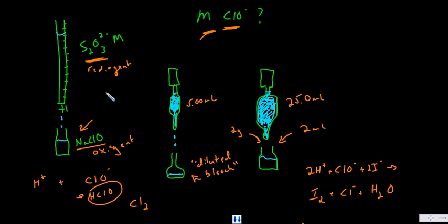And so we're going to be preparing a solution of sodium hypochlorite first. So we're going to take commercial bleach solution, which is bought in a grocery store, and dilute it a little bit. So we'll take 5 milliliters of it using a volumetric pipette, which is very, very precise. Hence, we get these extra 2 digits after the decimal. So we'll take 5 mils of that commercial bleach and put it into a volumetric flask and dilute that until it's at 100 milliliters. So this we'll call our diluted bleach solution.